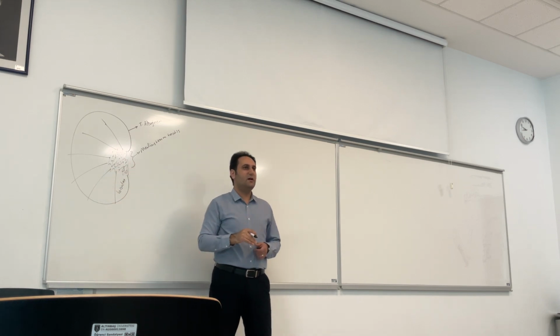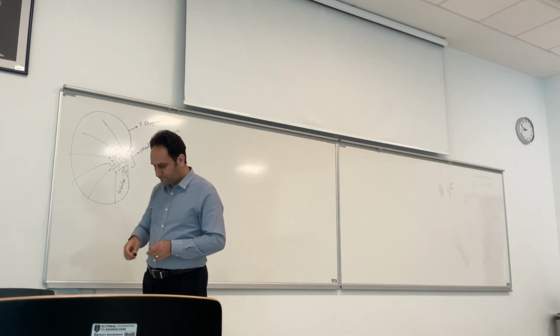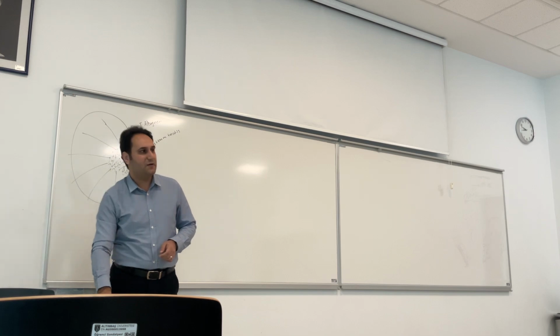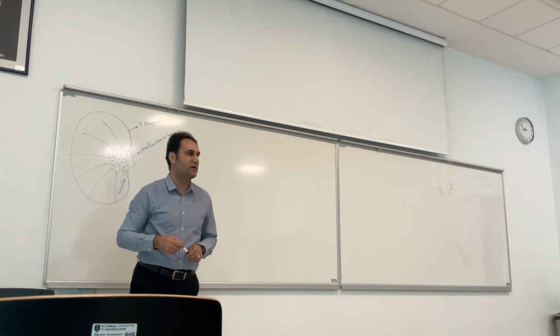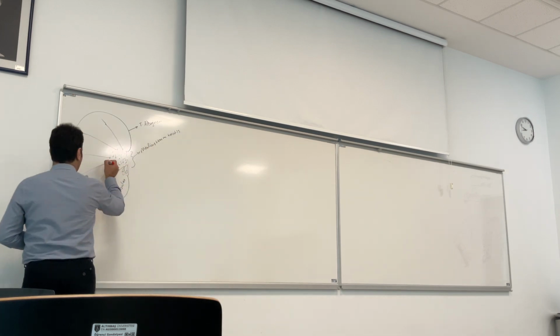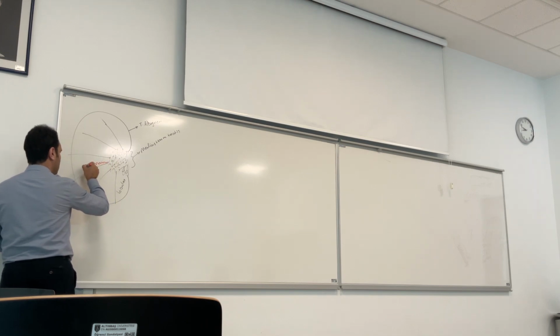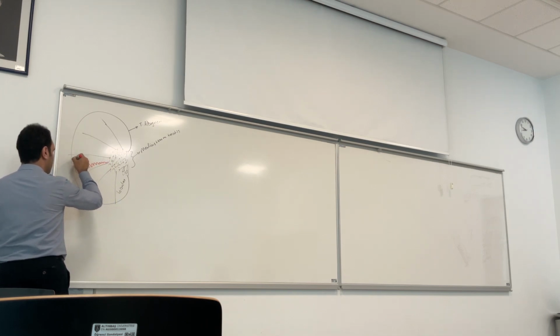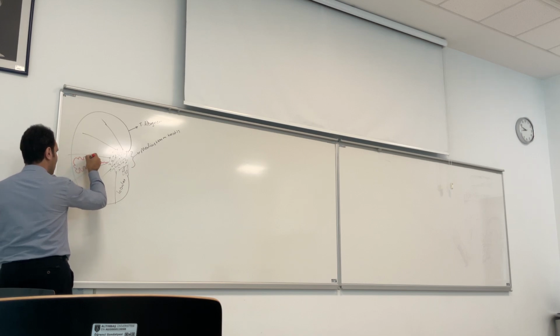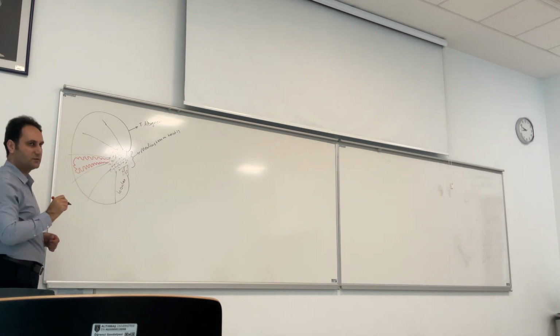In the inner side of the lobules, we have the seminiferous tubules. For example, here we have a seminiferous tubule, starting from this part and convoluting in this part, turning at the end part and again convoluting and continuing with this.